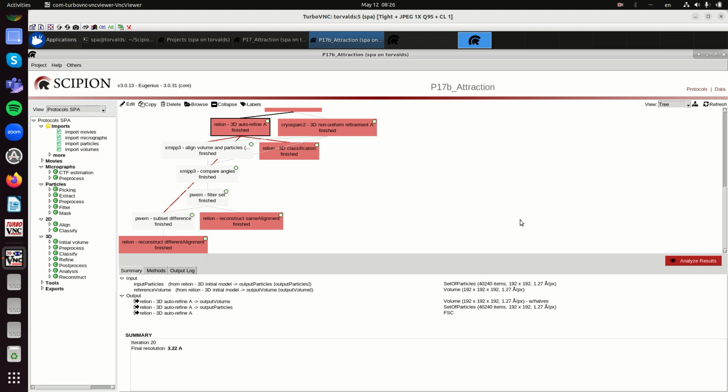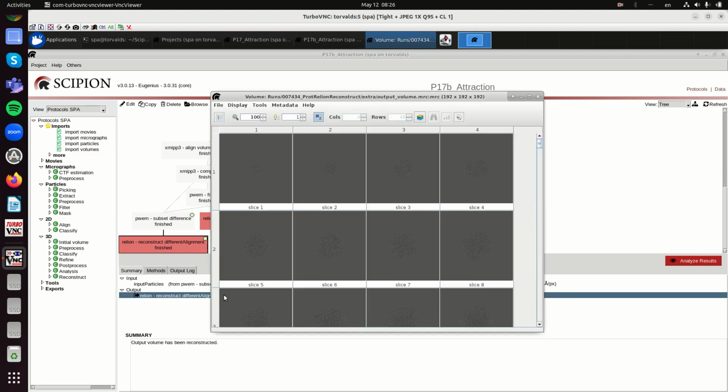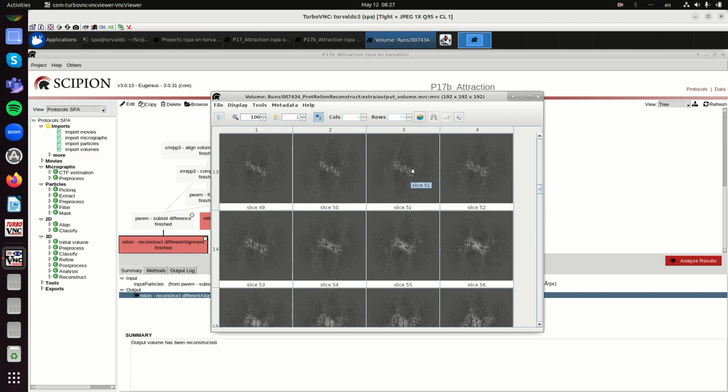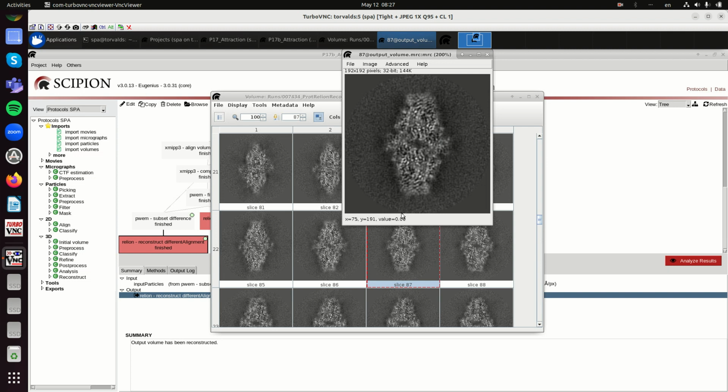So alignment is really a problem. It is simply a local minimum, caused by gaining signal to noise ratio. The misplaced particles have gained a lot of signal to noise ratio. We see the structure has a very clean background with a little bit of artifact here, so that is why we recognized this problem. But there is a lot of signal in between. There is a high signal to noise ratio, only that it is the incorrect signal.